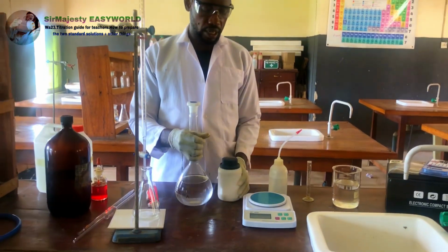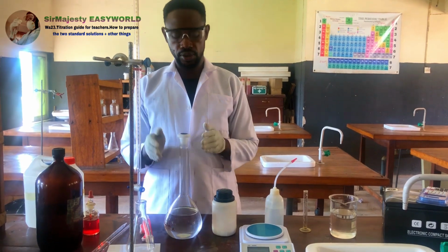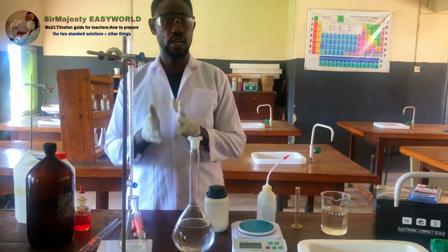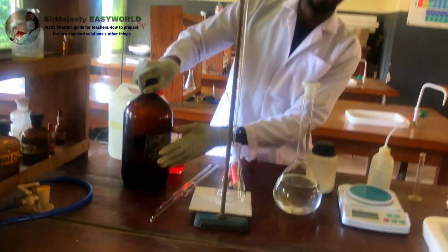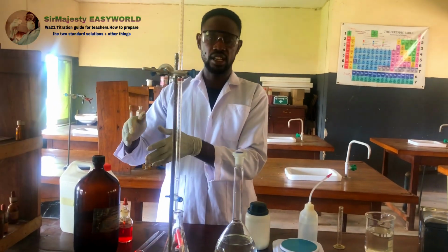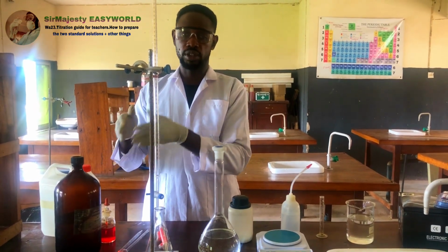Then for solution A, the instruction here is to measure 8.5 cm cube of HCl and then dissolve it in a given volume of water, then add up to 1000. The problem here is that the HCl also has challenges. This stock solution here you are seeing is the stock solution of HCl. You know the concentration of hydrochloric acid in this stock solution by assessing the SG. When you get the SG, that's the specific gravity, you can now tell the percentage concentration. If you can predict the percentage concentration, you can now talk about the molarity of it.